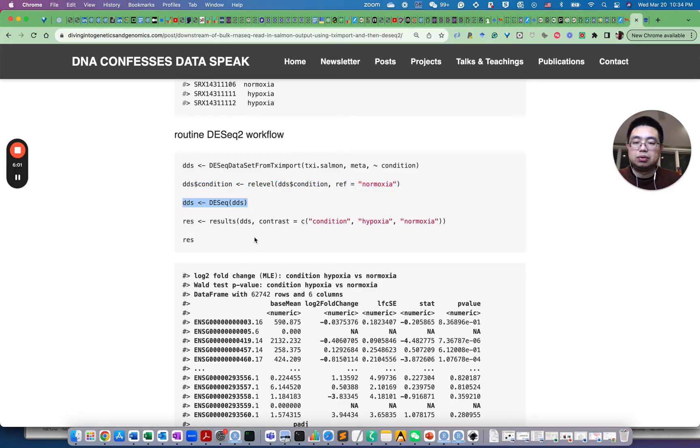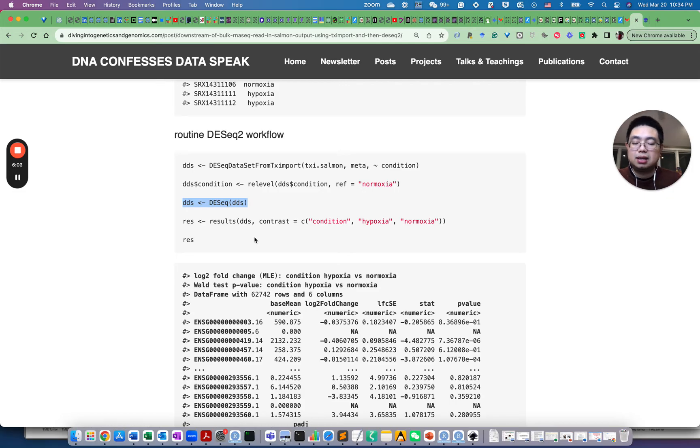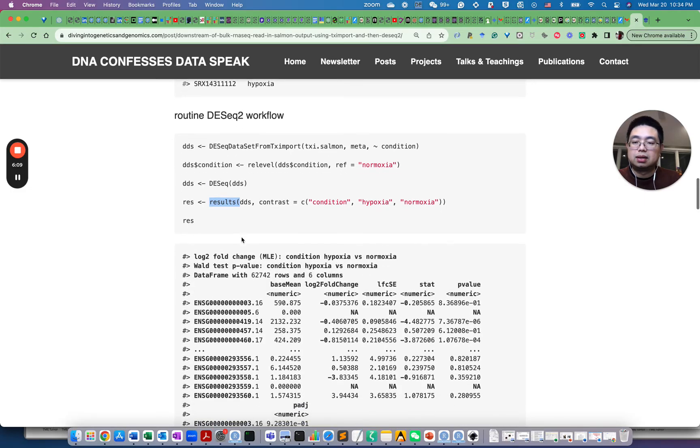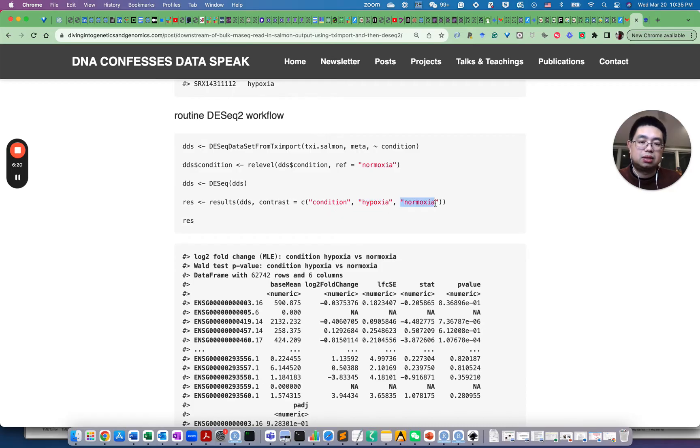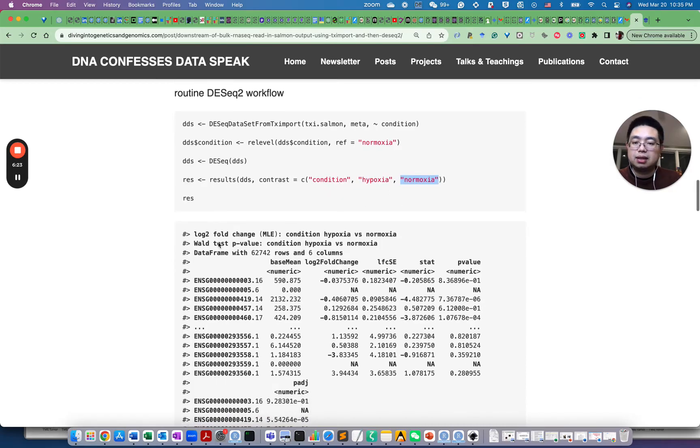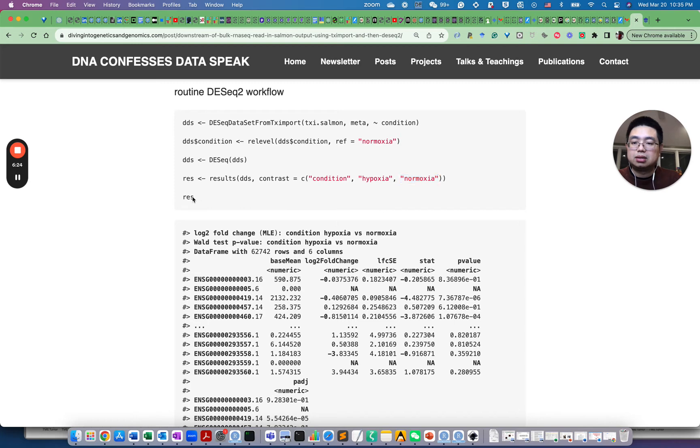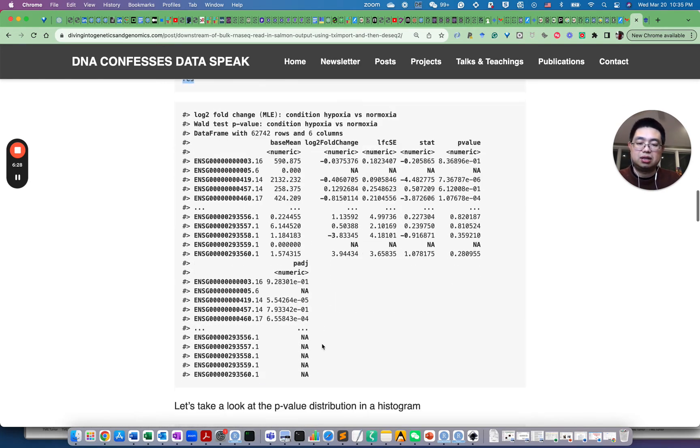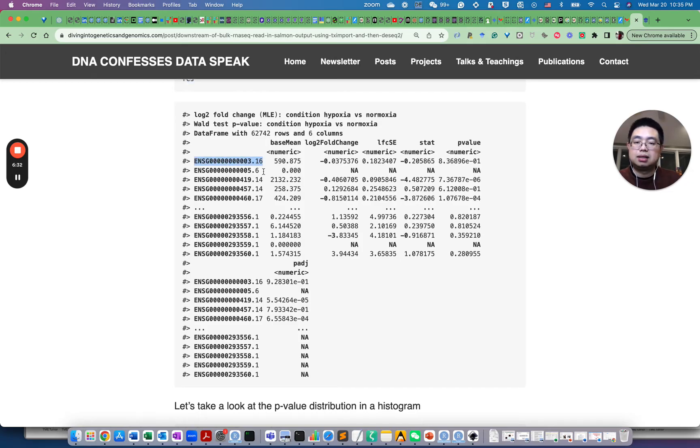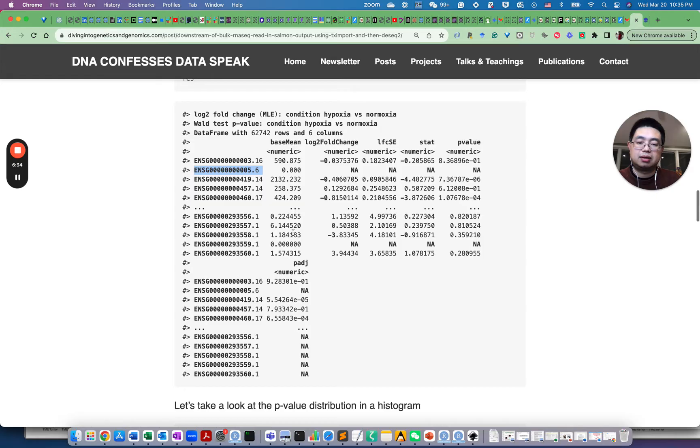And then this is just routine DESeq2 workflow and DESeq DDS, so we'll do all this normalization and then we can use the results function to calculate differentially expressed genes and then we specify the contrast hypoxia. This will be the numerator, then this will be the denominator. So essentially this is the results of the differentially expressed genes. As you can see, this is the Ensembl gene ID.